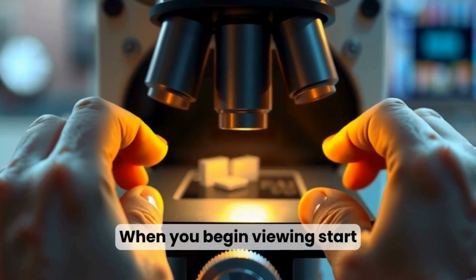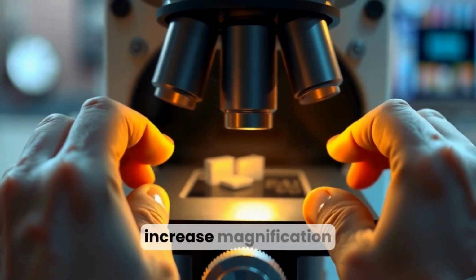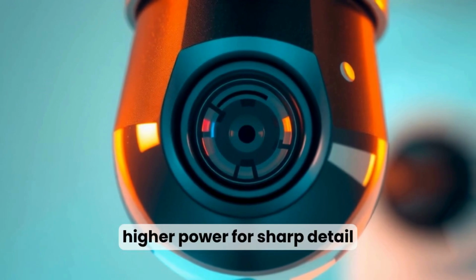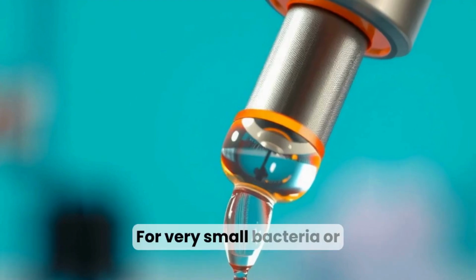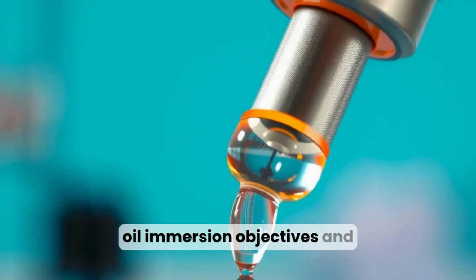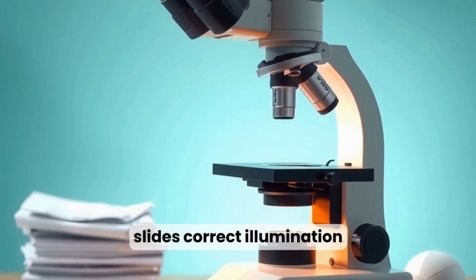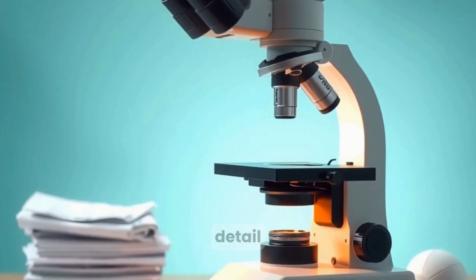When you begin viewing, start with the lowest power objective to locate the specimen, center it, and then increase magnification. Use coarse focus at low power, then switch to fine focus and higher power for sharp detail. Always refocus after changing objectives. For very small bacteria or internal cell structures, use oil immersion objectives and proper technique to achieve maximum resolution. Throughout, maintain clean slides, correct illumination, and steady sample placement to avoid artifacts or loss of detail.